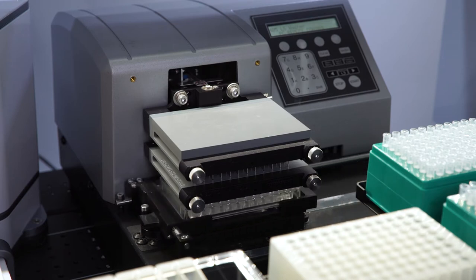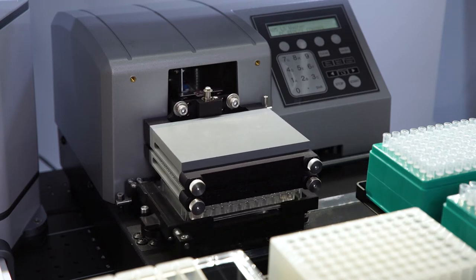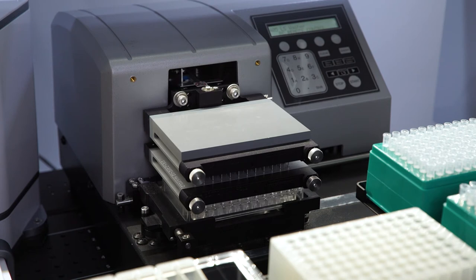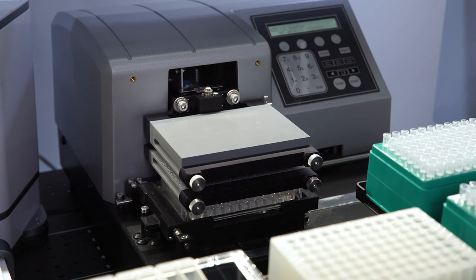Repetitive wash cycles are a crucial yet cumbersome step in ELISA. Plate washers can be readily integrated to the Biomech for rapid plate processing during high throughput applications.